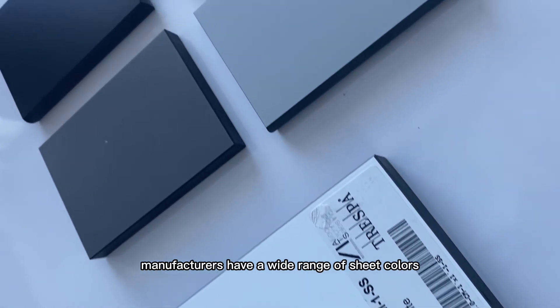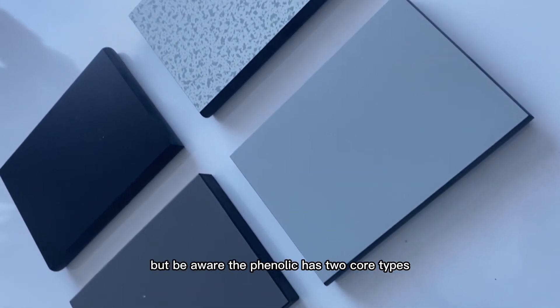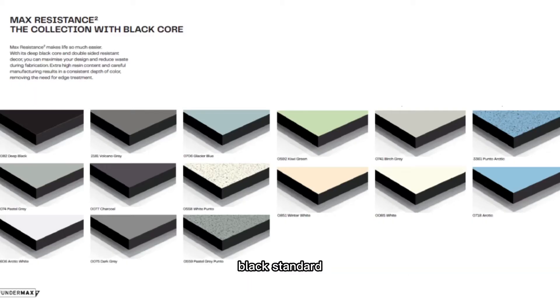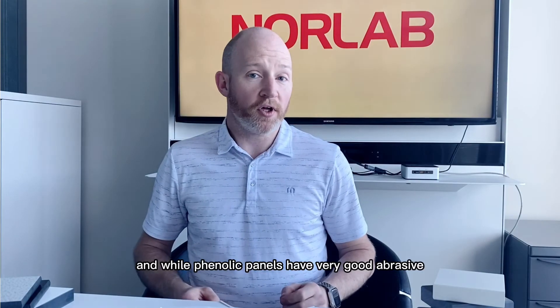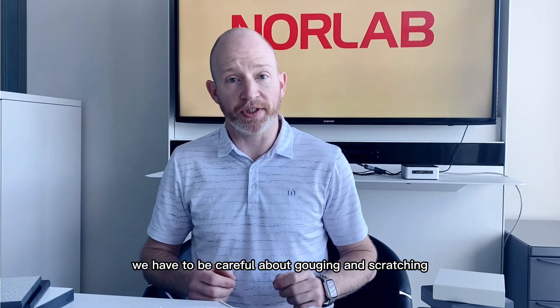Manufacturers have a wide range of sheet colors and patterns available, but be aware that phenolic has two core types: black standard, where the core and edge are black regardless of the top sheet color, and colored core, where the core and edge are available in solid colors to match some of the top sheet colors.